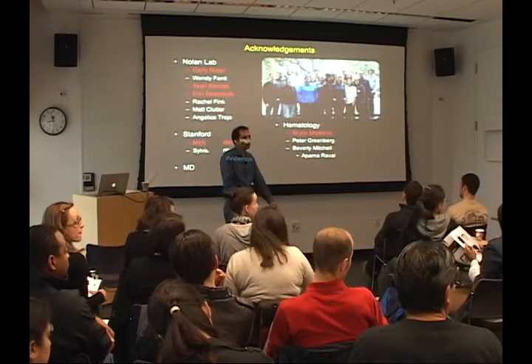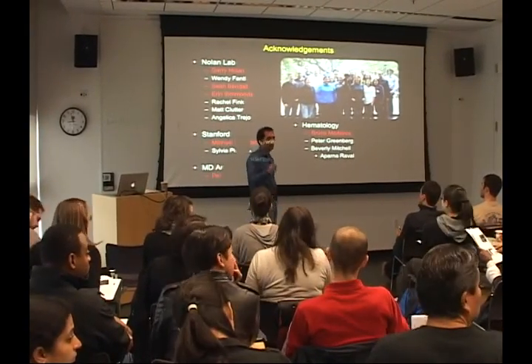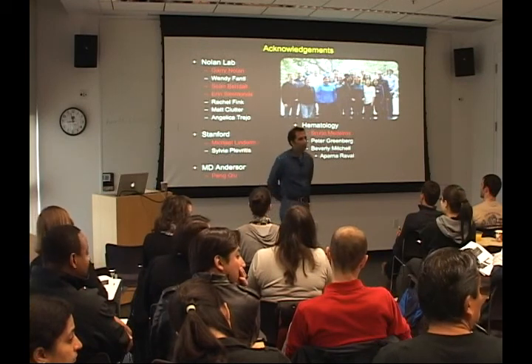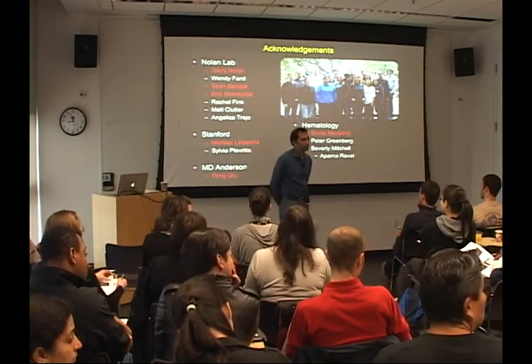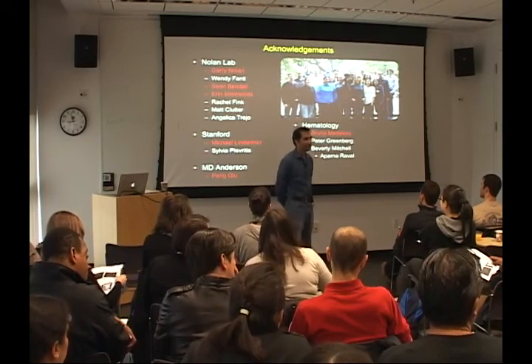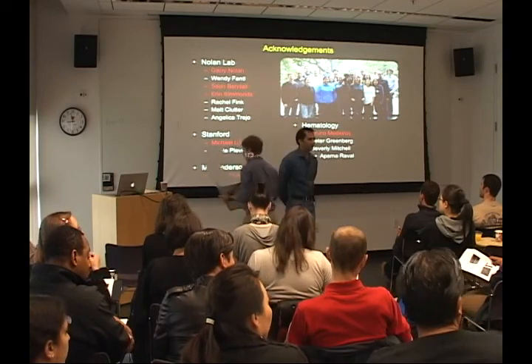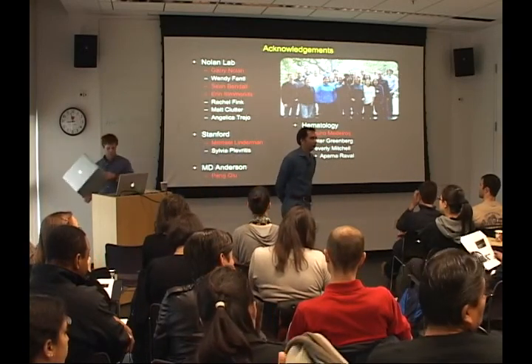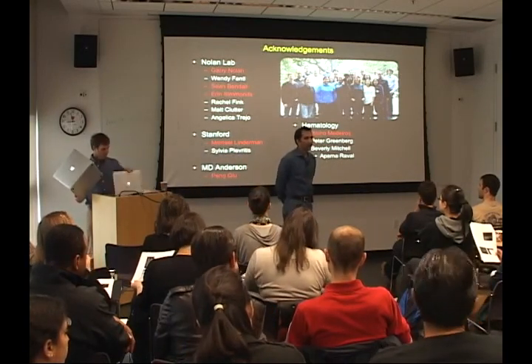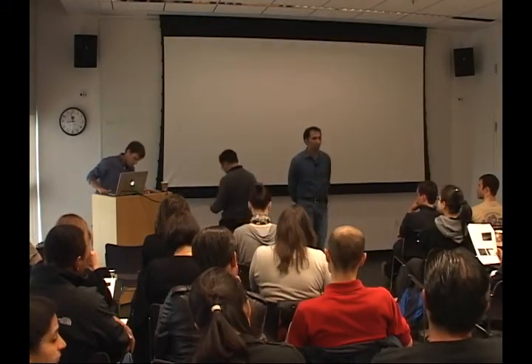Greg, back to your AML sample, you had 2 different phenotypes basically there. And so you're going to use those as prognostic indicators for patient outcome. Hopefully. Takes a lot of patience. Can you go back and actually pull those cells out, using something like flow, sort and see what kind of mutation it is?